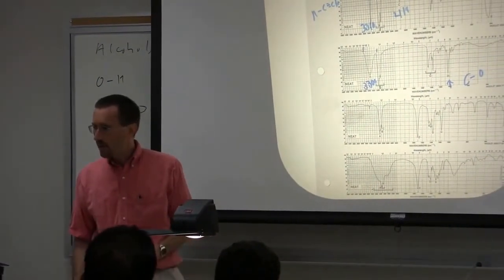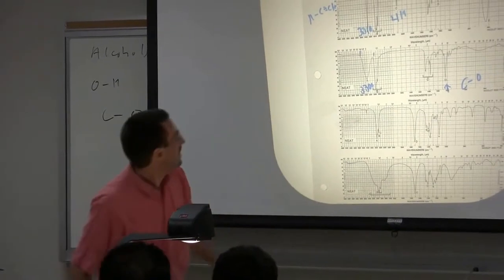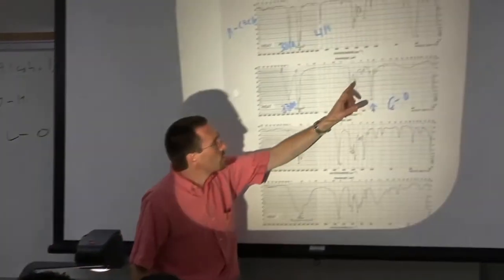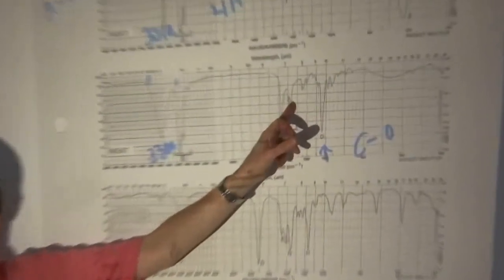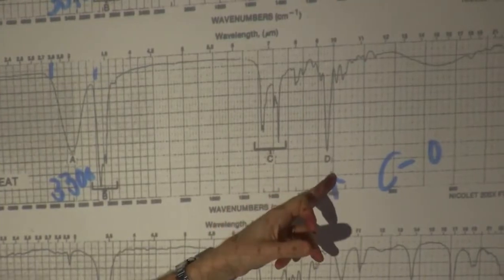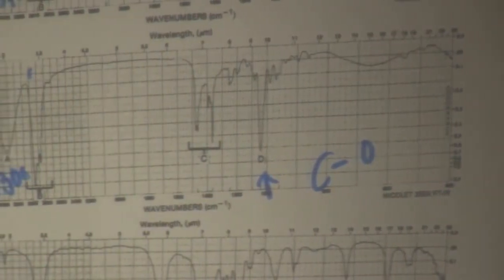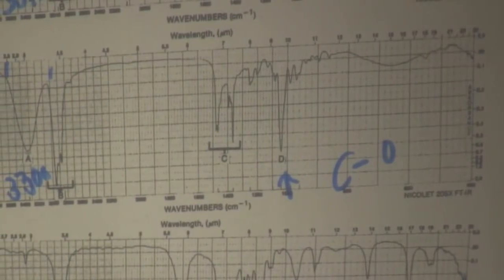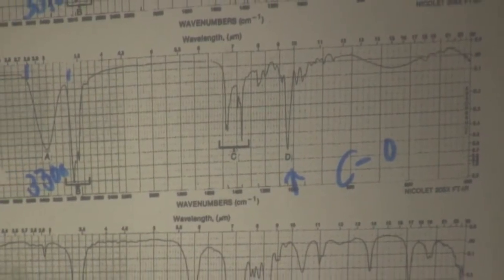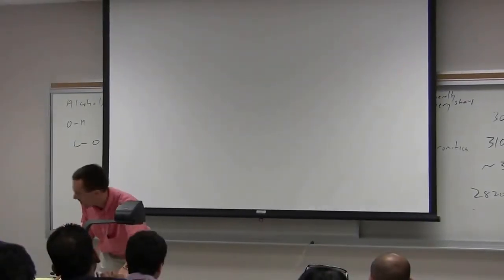And again, there are better ways to do it in general. But in the CH bending region, you can actually determine the difference, for example, between a single methyl group and an isopropyl group. Some of that is coupled vibrations, where an isopropyl group gives you a special coupled vibration that you can pick up. But there are probably better ways to do that, and in big molecules, things are just awfully crowded.